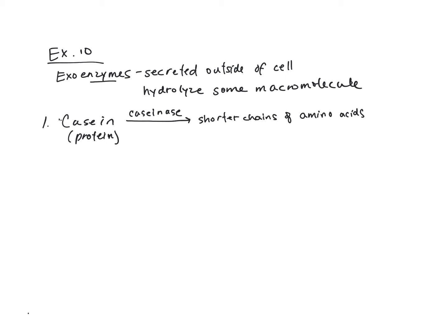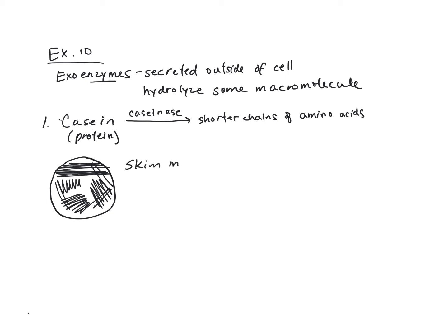Okay, with all of our inoculations on plates today, we're going to practice our 4-quadrant streaking technique. So it might have been a few labs since we've done this. Remember, first quadrant, pretty heavy. Second quadrant, make sure you're flaming in between there. So we're trying to spread out our organism, trying to get isolated colonies. And it's not really crucial that you get isolated colonies for these tests, but we want to practice that technique. All right, so streak it out, a 4-quadrant streak plate on your skim milk agar.